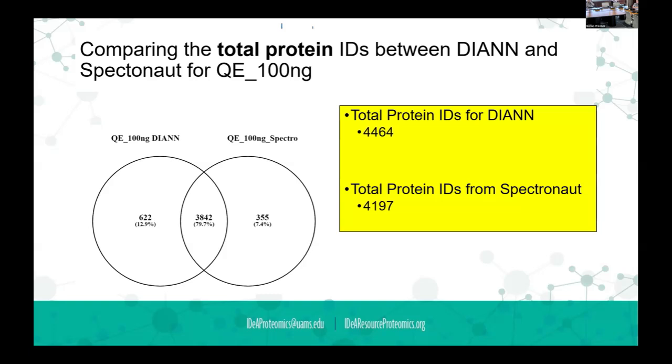Dennis, I have one question. Maybe she will answer tomorrow. If you wanted to customize databases in DIANN, is it easy to do? Suppose you're working with species that are not very well known or popular, like certain bacteria or certain fungus.